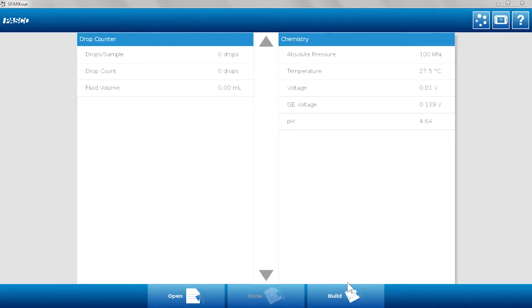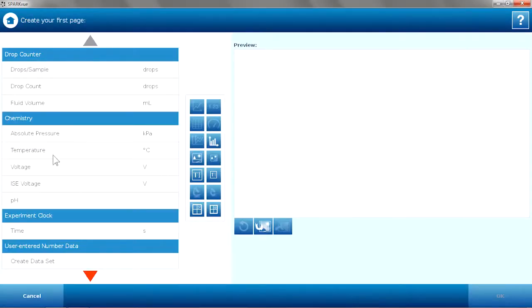I'm going to build a graph, build a page of pH versus fluid volume.